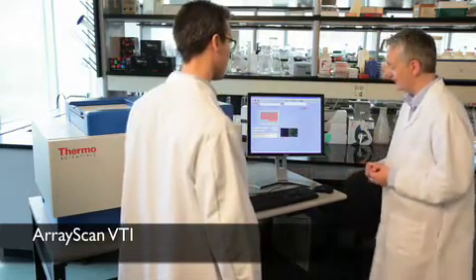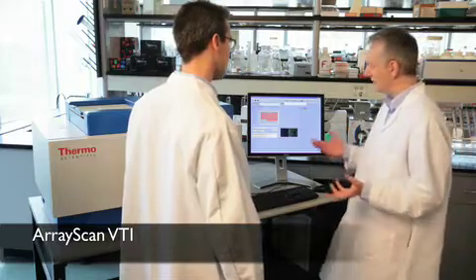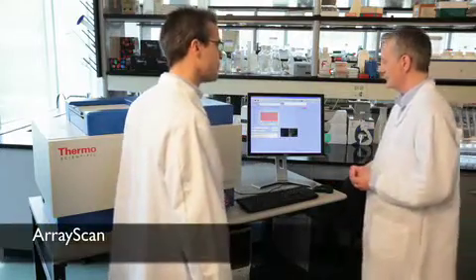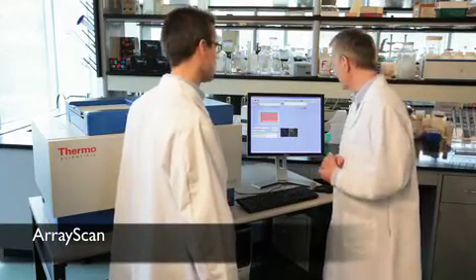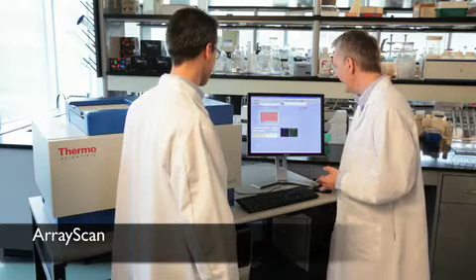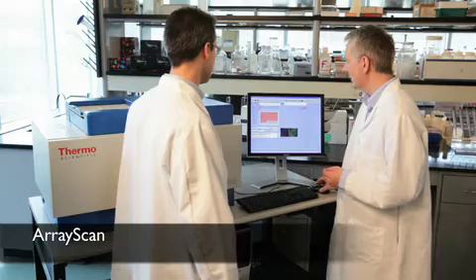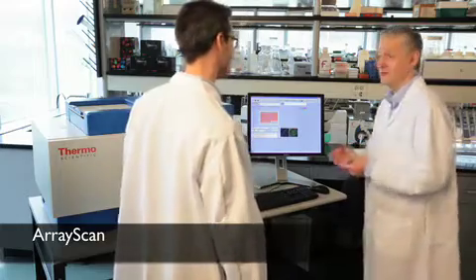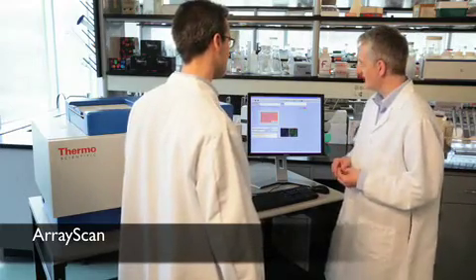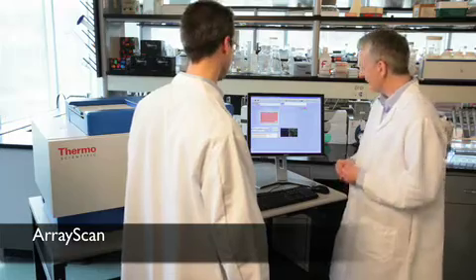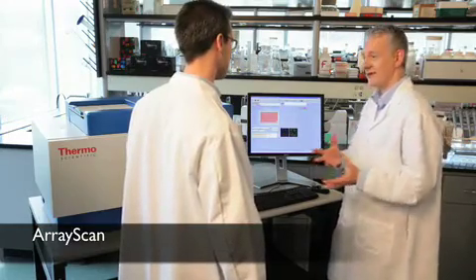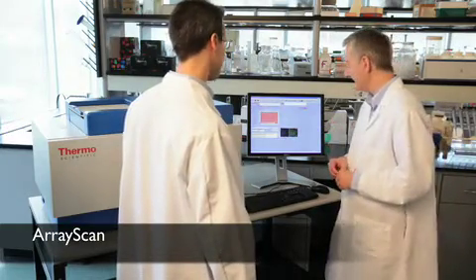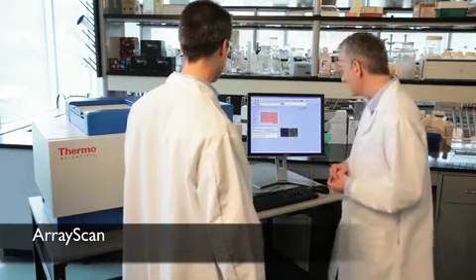So yeah, the image analysis is going on. And one of the really nice things is that we don't have to have a super computer or a grid computer. We're doing all the analysis on this instrument PC here. It's a pretty modest system PC here. So acquiring images, doing that real-time analysis. And again, I didn't optimize this protocol too much. The software, some of the screens in the software that we could go to, not what we're scanning, that allows you to do some really easy protocol optimization to get the speed down a little bit. But it's not about the speed, remember. It's about really getting you that quality data, those multi-parameter measurements about this particular biology that you have here.